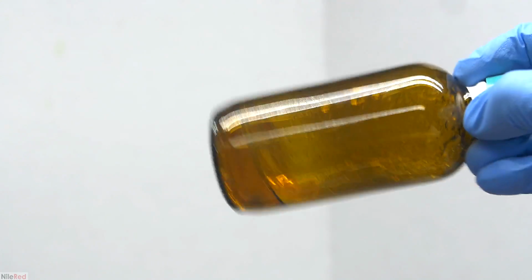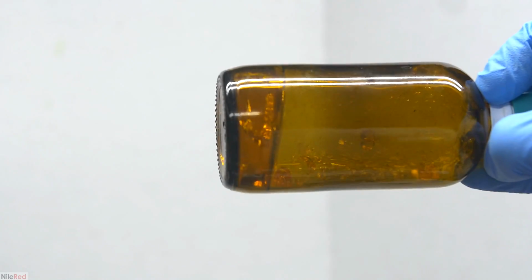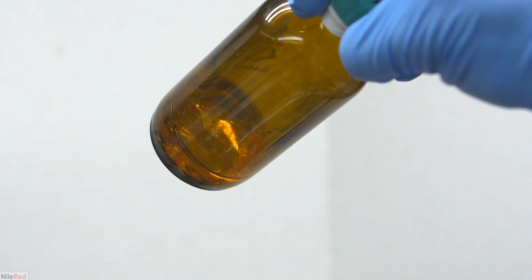I checked the acrolein a few days prior, and it was still a liquid and very usable, so I didn't bother checking it before I started this preparation. So long story short, I went to pour out and measure the acrolein, and nothing came out because it was completely solid. At this point, I had two options: just to smash everything, give up, and forget about the whole project, or I could try to run a salvage mission.